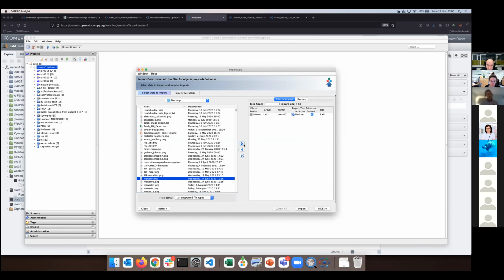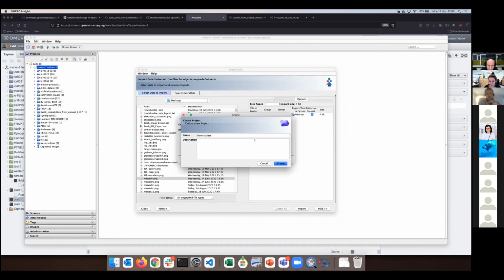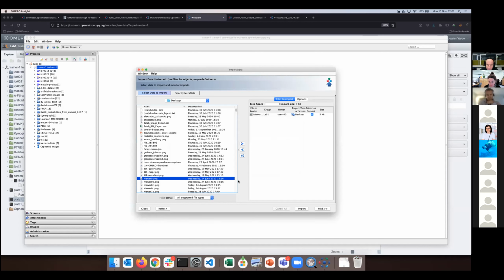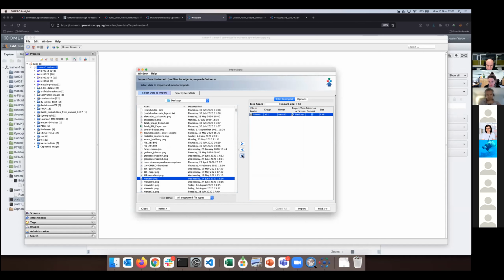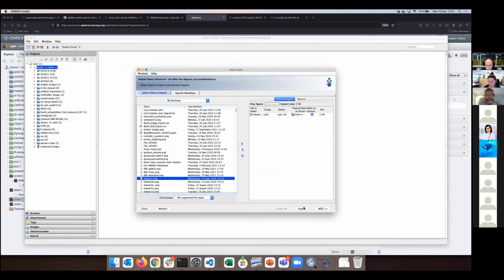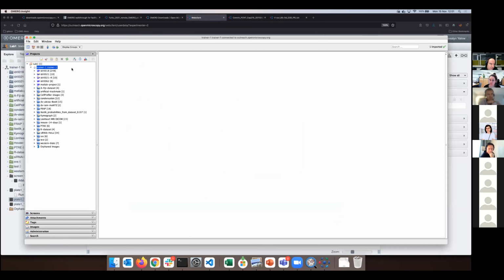I can make it more visible by creating a new project and saying from trainer one, but it is Rosalind's. Okay, I create such a new project. I add it to the queue. It just kicks back because it's already in the queue. So now I add it into the queue and I import and it uploads. Okay, I can refresh.